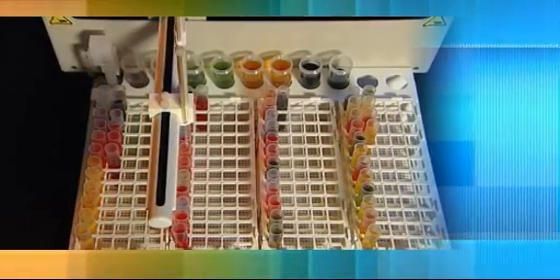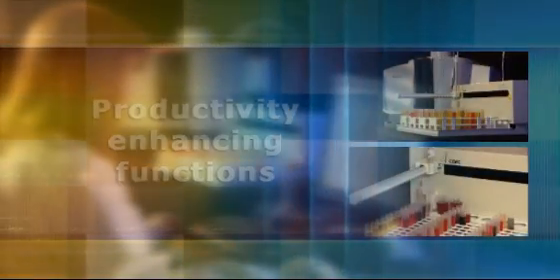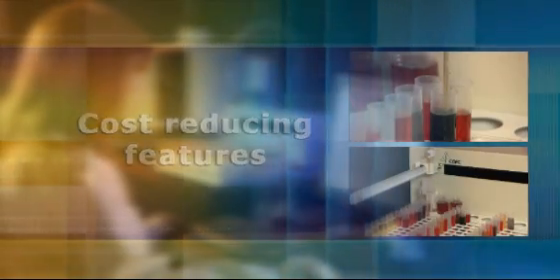leading to fewer repeat analyses. These productivity enhancing functions combine with further cost reducing features to produce the most cost efficient ICP available.